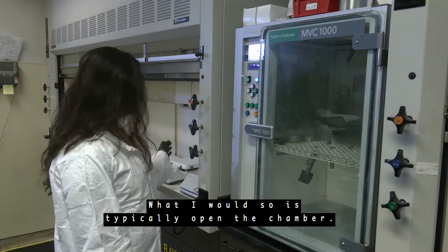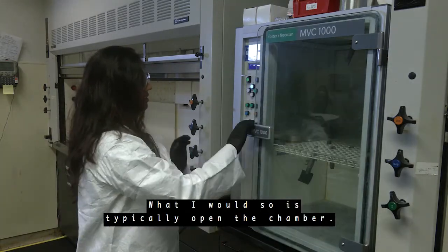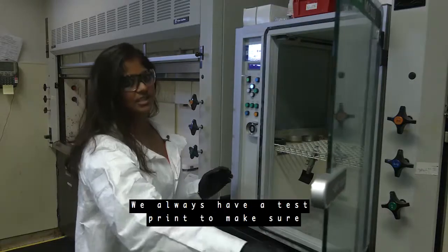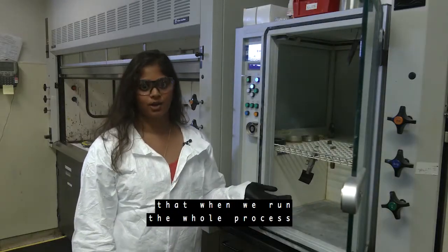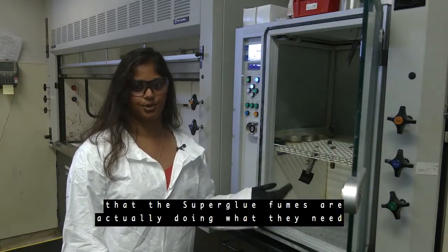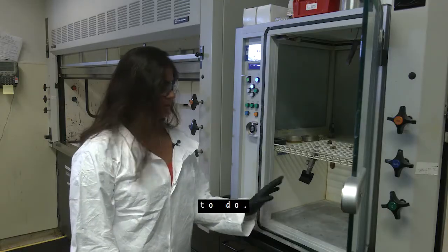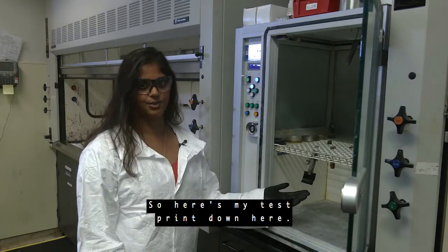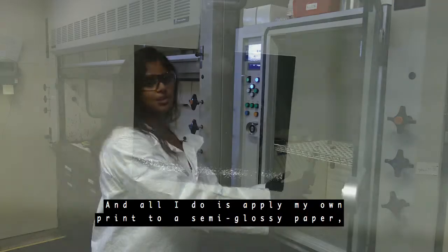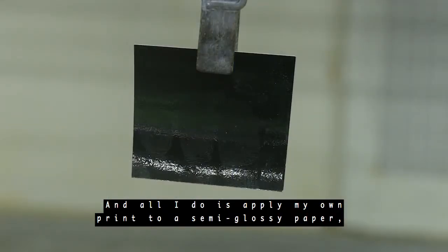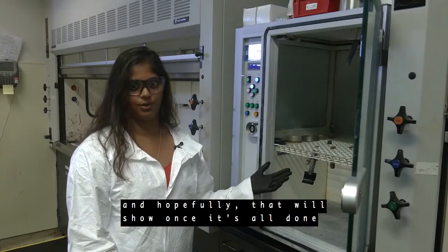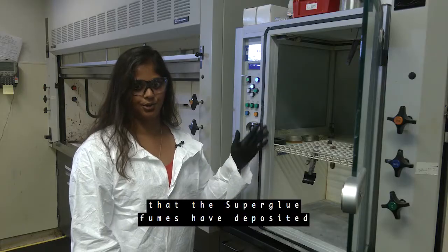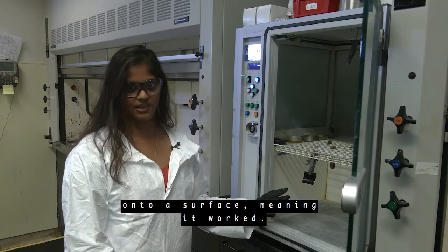What I would do is typically open the chamber. We always have a test print to make sure that when we run the whole process that the superglue fumes are actually doing what they need to do. So here's my test print and all I do is apply my own print to a semi-glossy paper and hopefully that will show once it's all done that those superglue fumes have deposited onto a surface, meaning it worked.